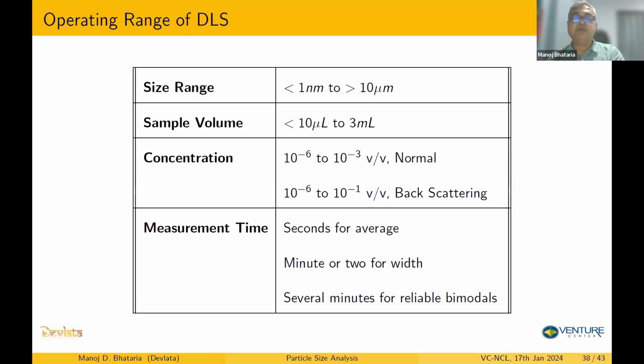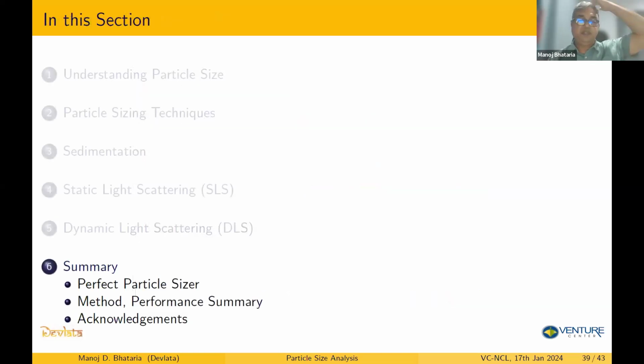So measurement time is fairly fast, as you say, seconds. If you want to, 3 minutes is very typical. But if you have bimodals, then you like to give it more time for measurement of the size. Okay, so that's what we cover with the DLS part.